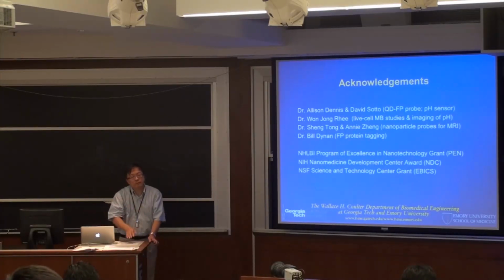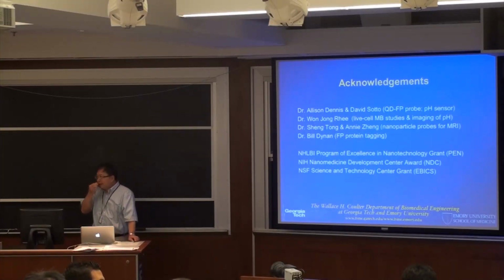Yes? For photobleaching, is there any way to reactivate the fluorescence? With what? Photobleaching. Oh, photobleaching. In a way, yes. Again, depending on the fluorophores, right? Some of the fluorophores could have a so-called dequench, but that may take a while, right? So although it's possible, for most of the biological studies, perhaps you don't want to wait for too long, right? So I think a more effective way is trying to overcome photobleaching.